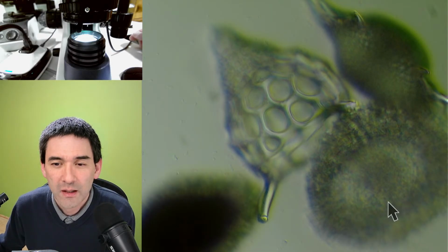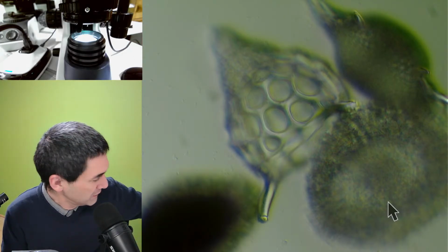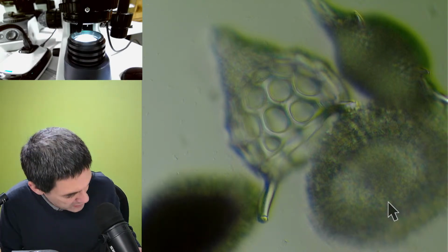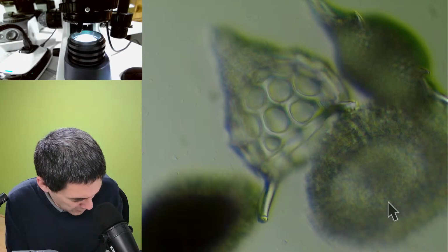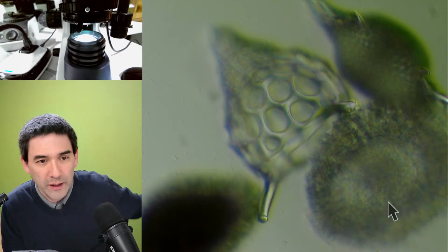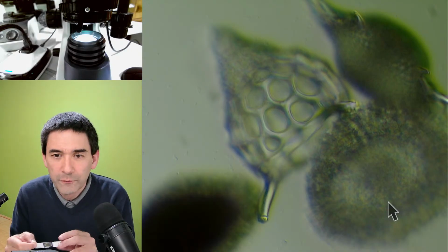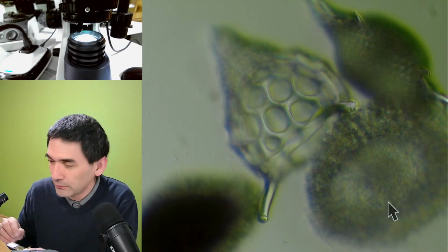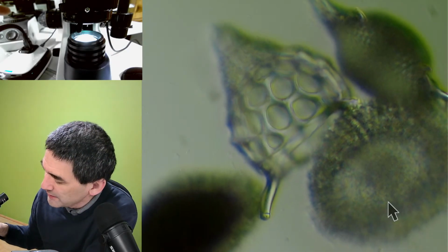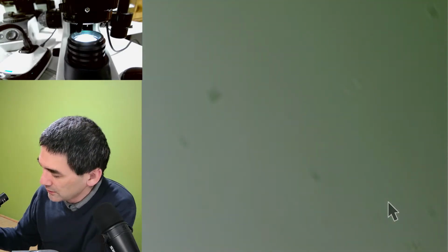Yeah. Do you ever look at forams? Okay. Let me check. Number four. Question: what are forams? Here it is, I got a slide. Okay, foraminifera. Yeah, because you're asking. These basically have shells made of calcium carbonate, and they also look quite nice.